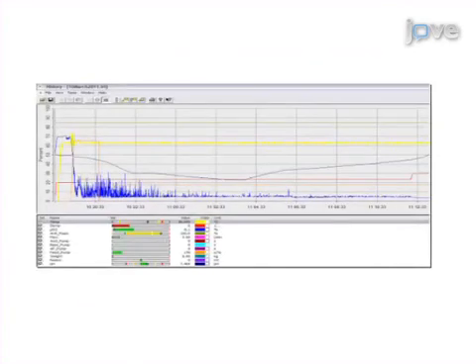Ultimately, the growth characteristics of the culture can be analyzed, and the culture can be processed for extraction and purification of the desired product.